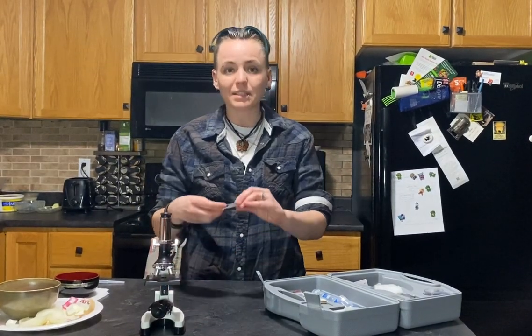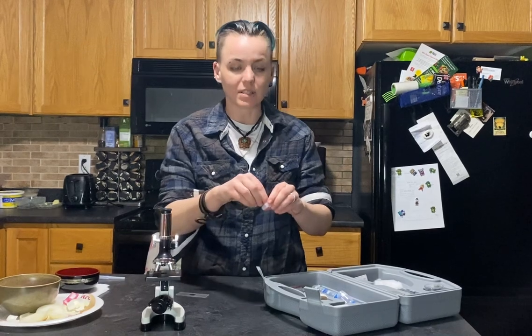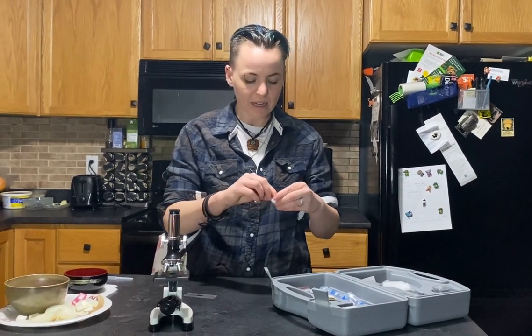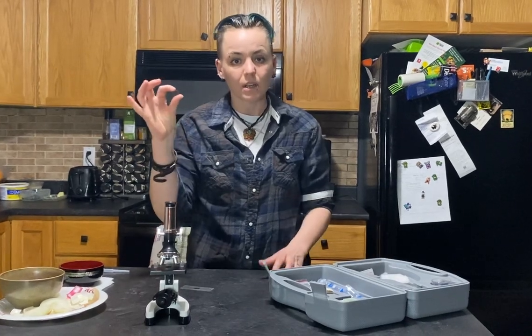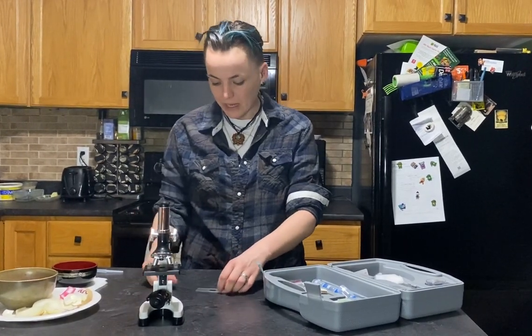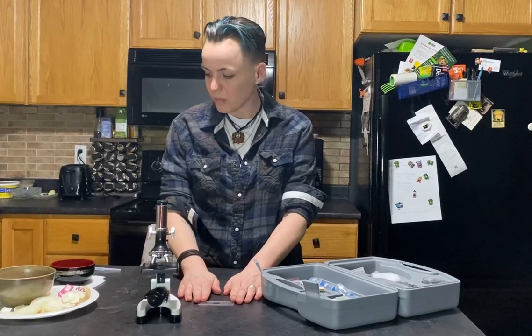So you have slides — these little plastic slides — and you have cover slips. Cover slips are basically tiny little plastic pieces that you use to cover whatever it is that you're actually looking at on the slide. So there we go, we have those two components.